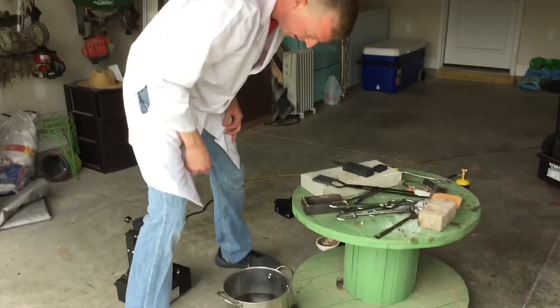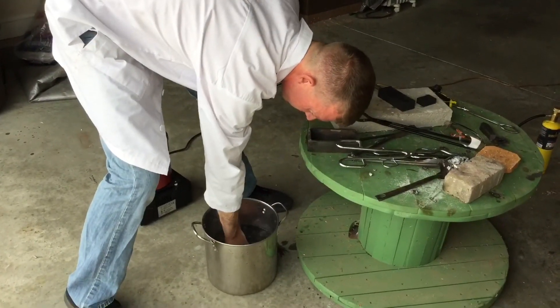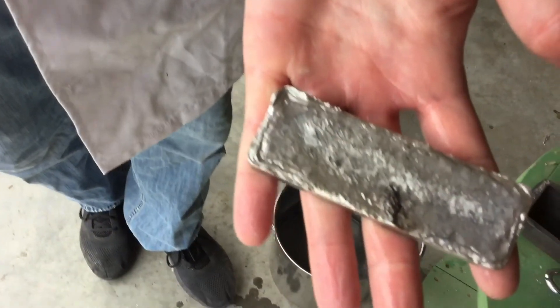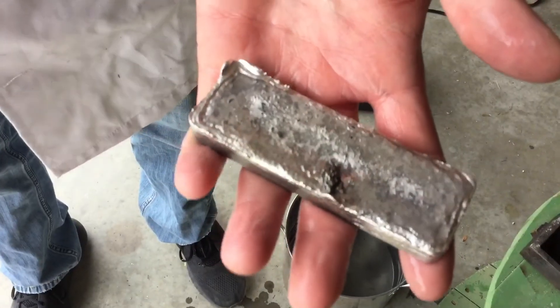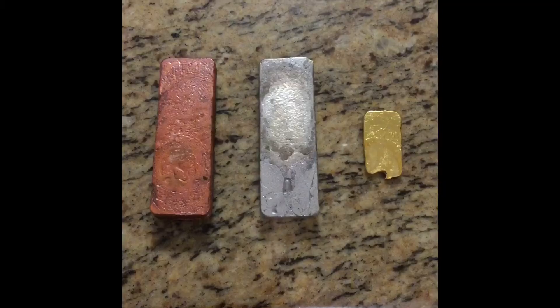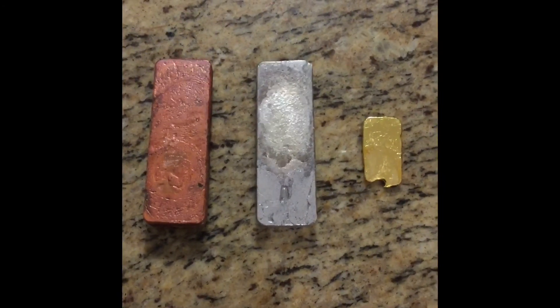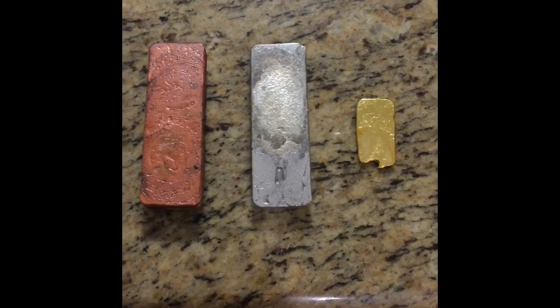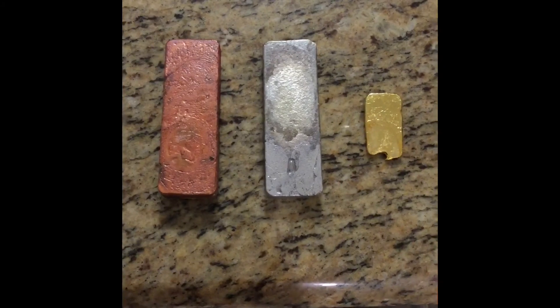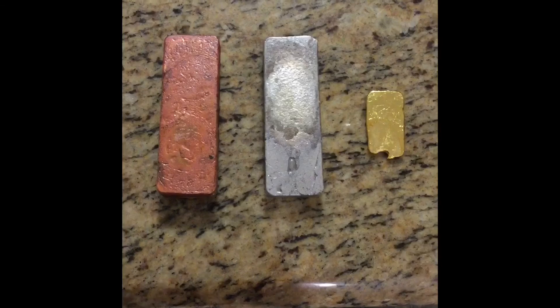It actually cools pretty fast, so let's see. As you can see, we ended up with some very pretty metals. I remelted the gold a couple of times because I didn't like the way it originally came out, but we ended up with a nice gold bar, silver bar, and copper bar.